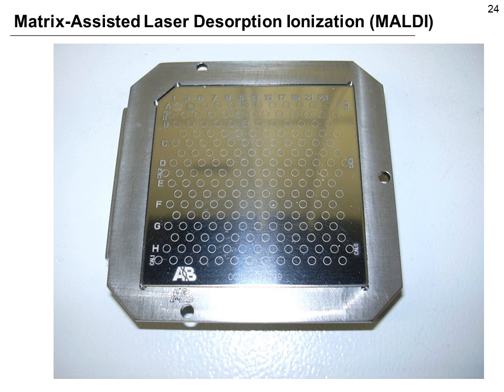As you can see, there are many little places on such a plate, so MALDI is a fairly high throughput methodology. You can deposit hundreds of samples on a single target plate, and then the laser will scan over the different deposits and produce mass spectra for each and every sample.